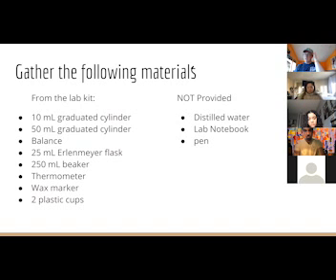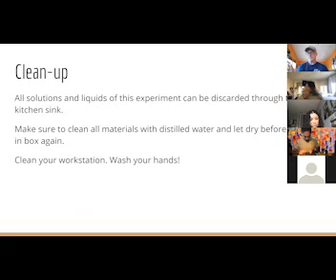Some of the reactions we're going to do later, it's going to be important to have distilled water, because if there are other ions in the water, it may affect the experiment. For this one, not so much. But for other experiments, it very well might. It might interfere. You can get distilled water at the grocery store for like, you know, $1. So it's really not that expensive. So for this one, not as important, but for coming up, it may very well be. So for cleanup, not going to be a problem today because it's just water. You can just pour it down the sink.